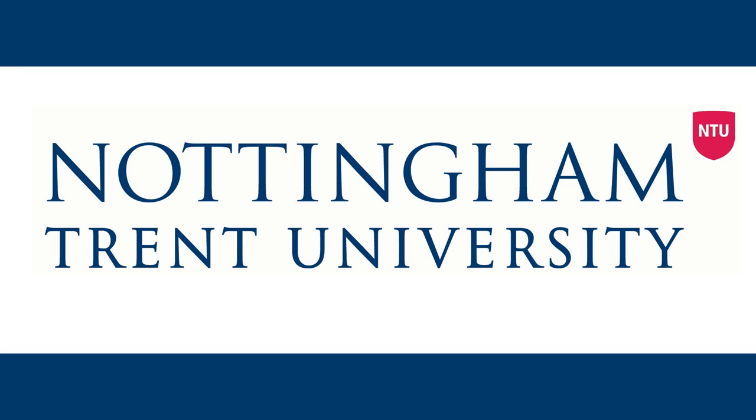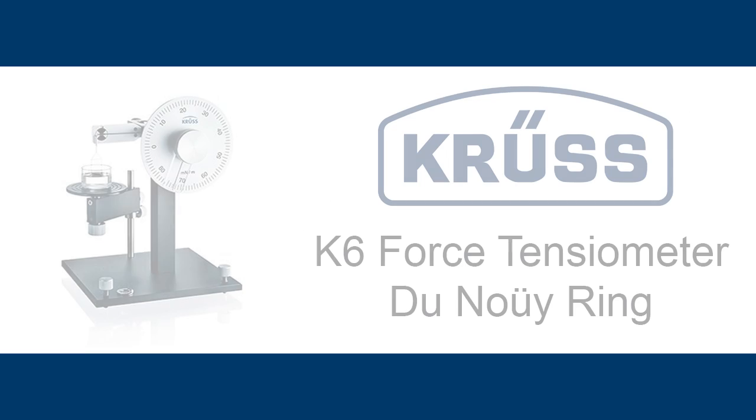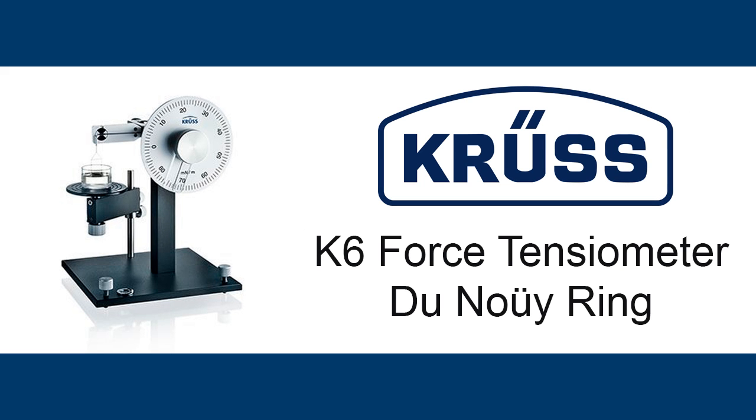This video will discuss two methods of making surface tension measurements. First, a manual method, the Kruss K6 Deneuil Ring.